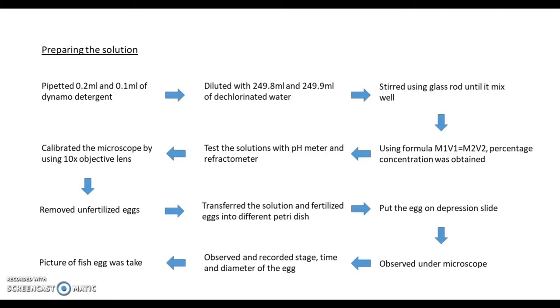The microscope was calibrated using a 10x objective lens before measuring the dimensions and structure of the egg. The unfertilized eggs at the bottom of the beaker were removed. Both solutions with different concentrations were transferred into two different petri dishes. The fertilized eggs were also transferred into two different petri dishes. The eggs were placed on two different depression slides with a small amount of experimental solution and observed under a light compound microscope.